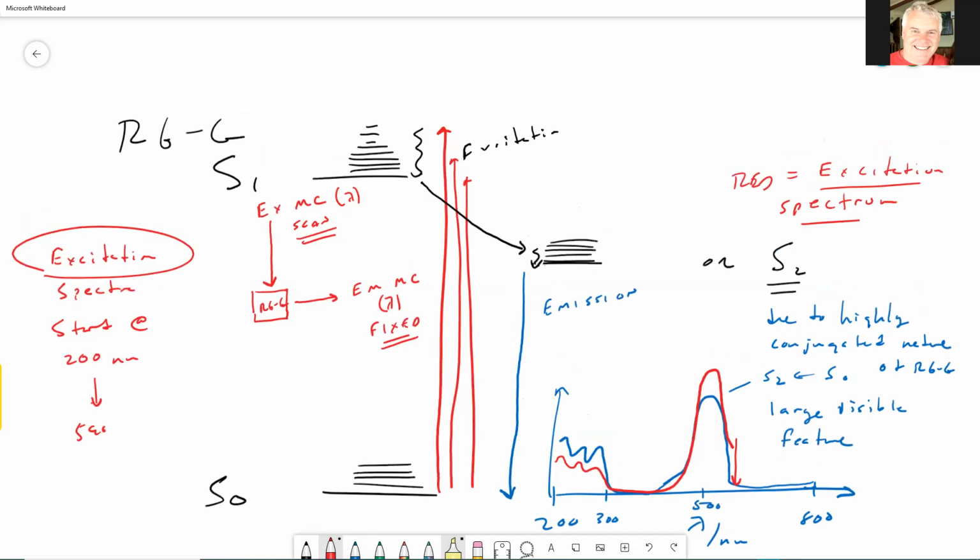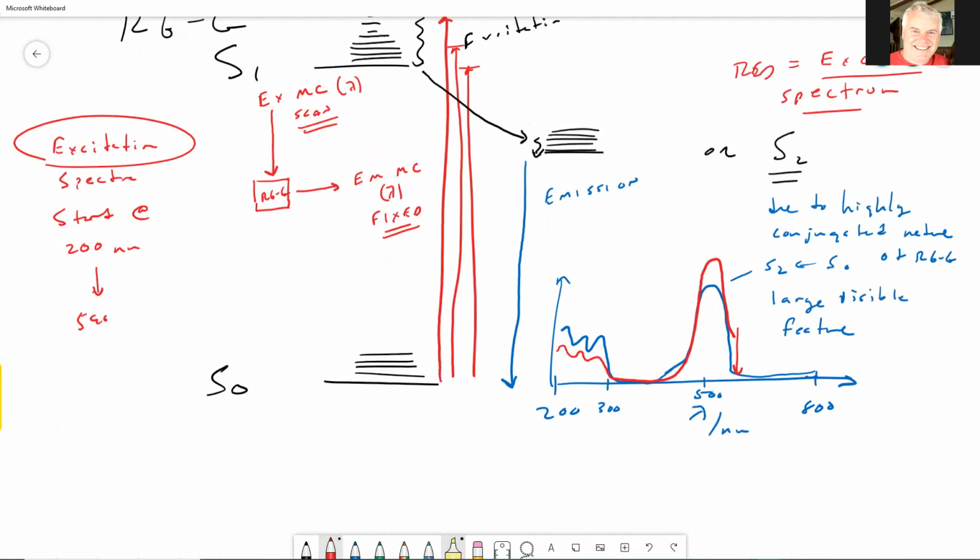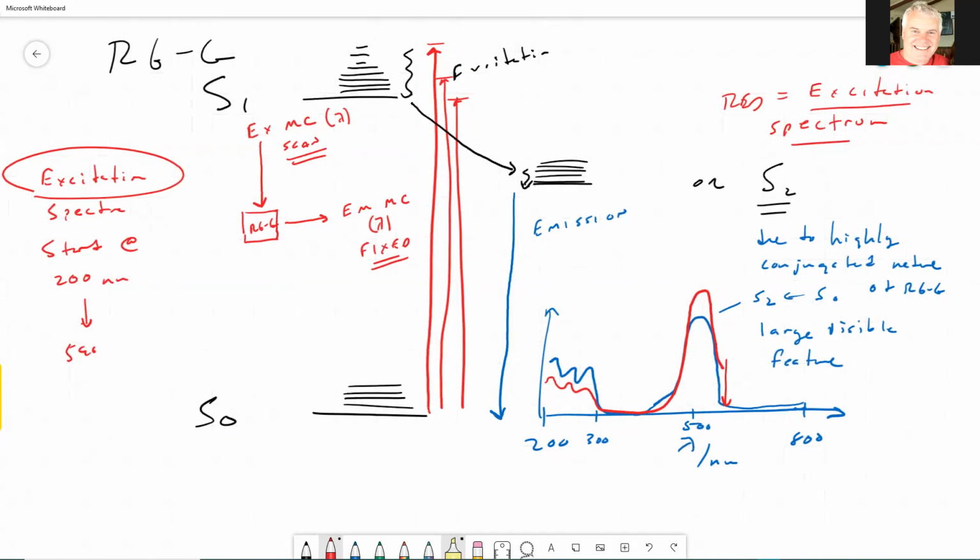And as we're going through these states, we're able to couple energy into the molecule through these states, which then decays and emits at this wavelength out here. Right? So let's see here. We can call this lambda EM, right, for the emission wavelength.